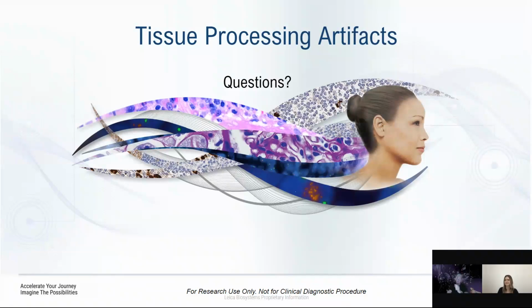We would actually take large specimens, keep the back half hinged, and make 1 centimeter slices, and then place paper towels in those spaces so the fixative has a road to travel down to leach into the specimen, so that it can start creating those cross links to preserve not just the architecture, but the morphology. And then the other part of that question, Kelly, you might have to remind me. Yes, the second part was, would the former method limit underfixation from occurring or autolysis? Yeah, and I think I addressed that.